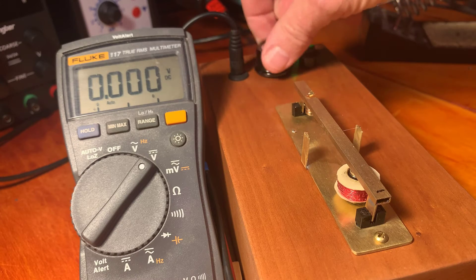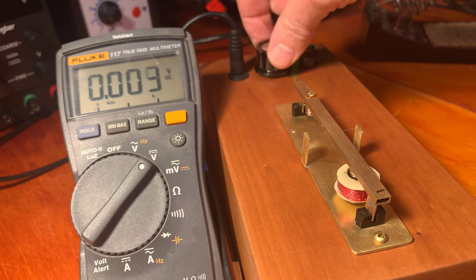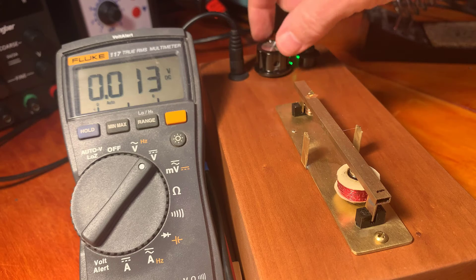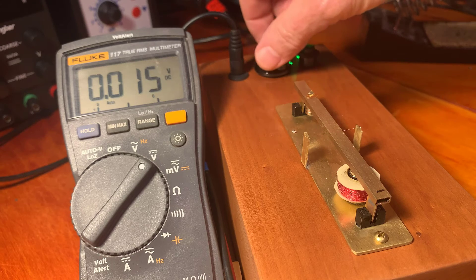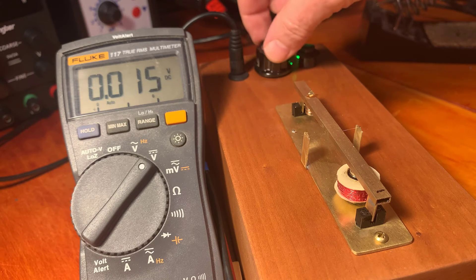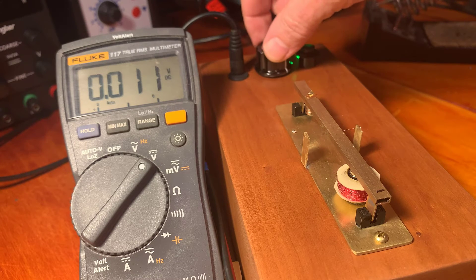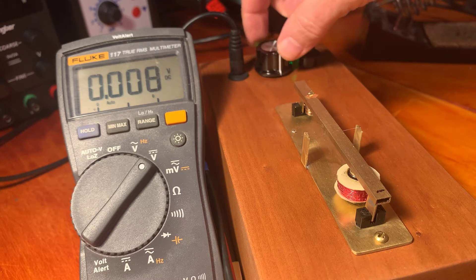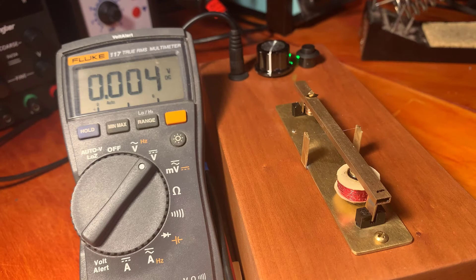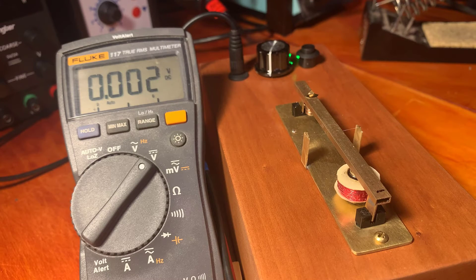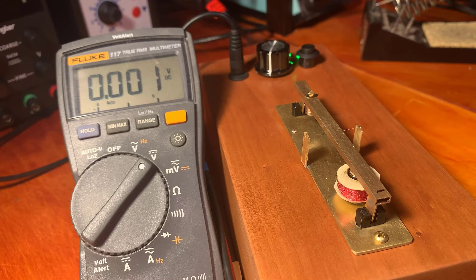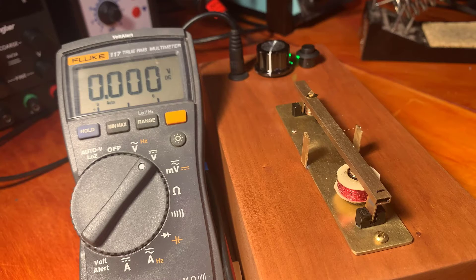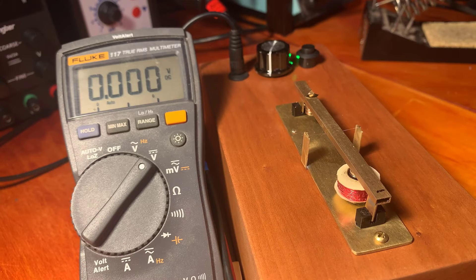And you can see when I turn this, I change the balance condition. So let's get this into balance. It has a settling time of about 10 seconds. So I have to be patient when I use it.